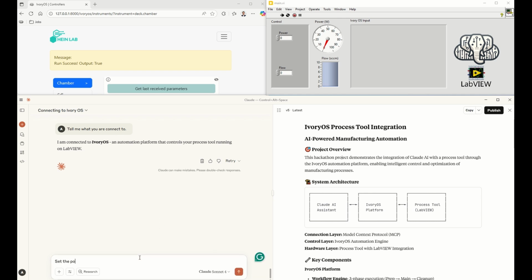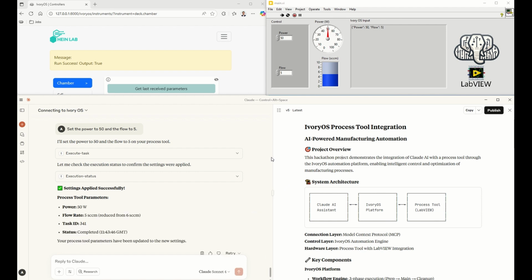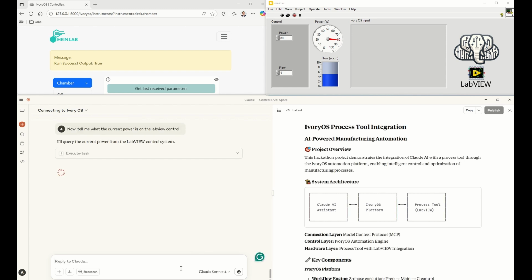This project focuses on integrating legacy and industrial tools. We built a TCP-based interface, linking LabVIEW automation with IvoryOS, thereby enabling natural language control of non-Python-based instruments. While our demonstration uses a mock LabVIEW SDL, the same approach applies to real processing or high-throughput characterization platforms. The TCP interface also works with industrial tools not typically included in SDLs.